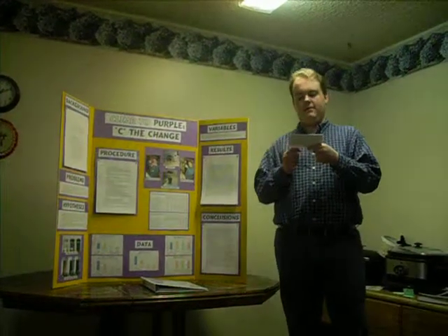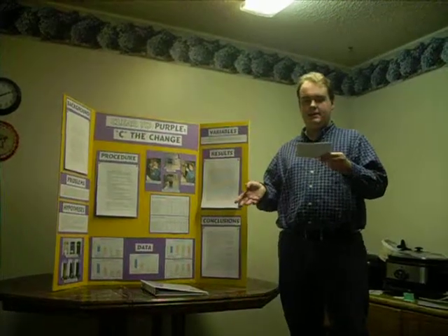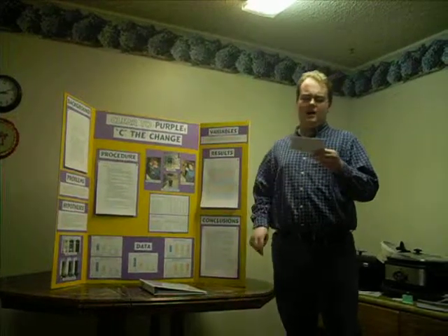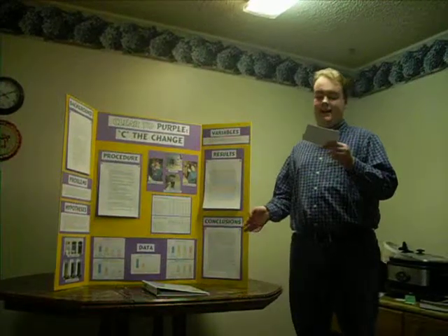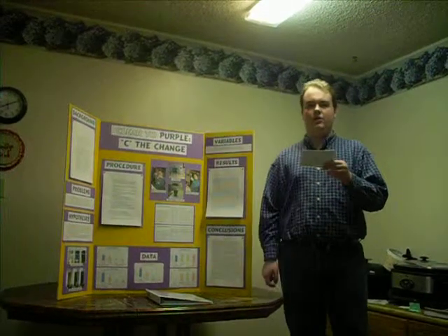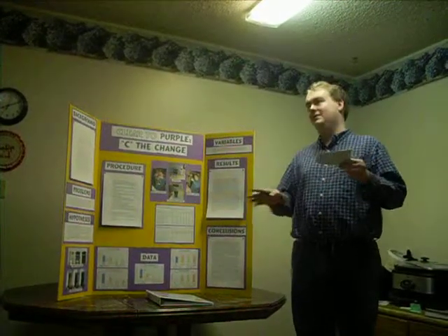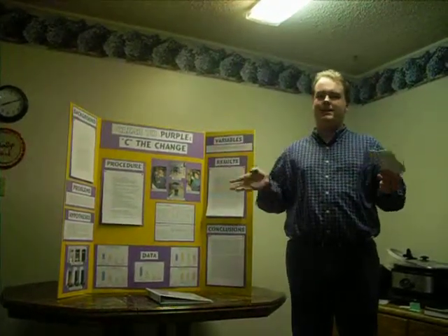The variables in the vitamin C clock reaction were the amount of hydrogen peroxide, iodine, and heat. I tested them separately so that they wouldn't mess each other up. The constants were the levels and types of other ingredients, the equipment, the time stirring, and the number of repetitions they each did. My control groups were the base group, and the groups that had 0 hydrogen peroxide and 0 iodine, and technically 0 degrees Celsius, although because of Kelvin that doesn't count as much.